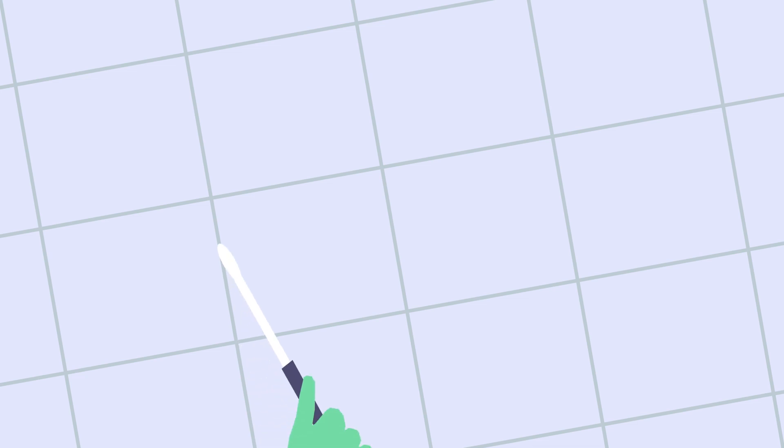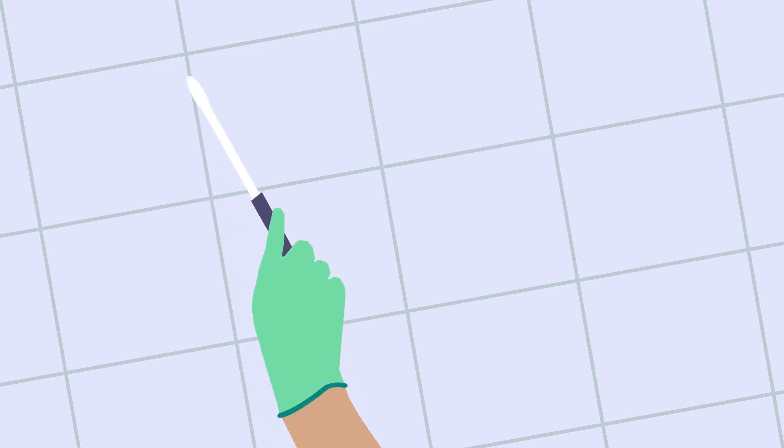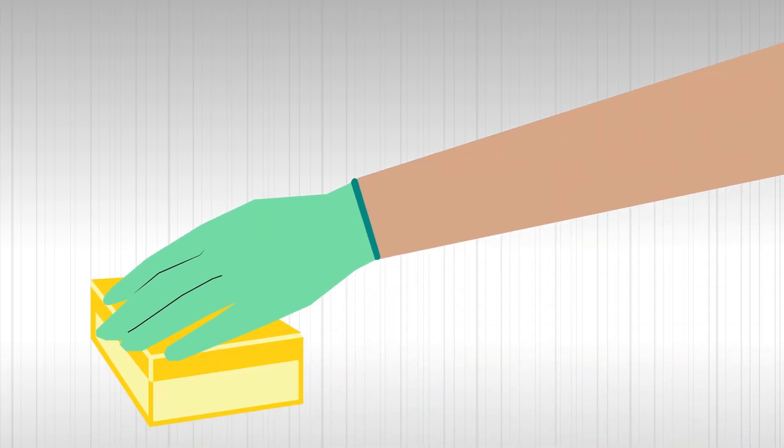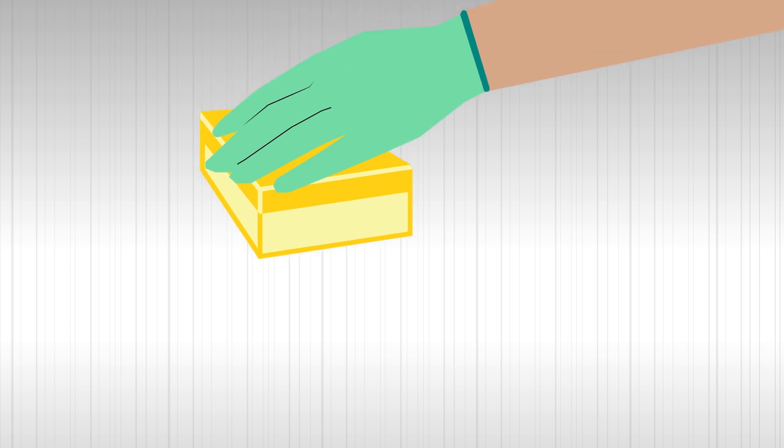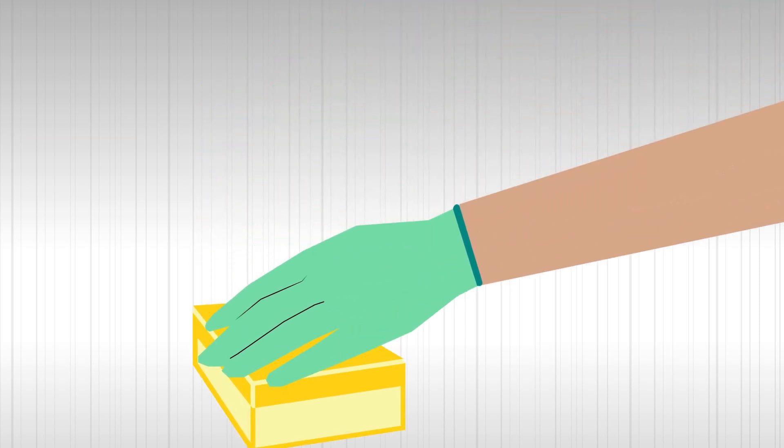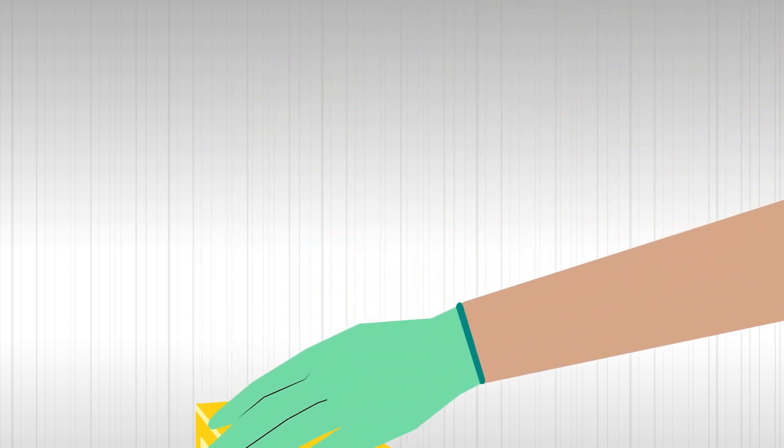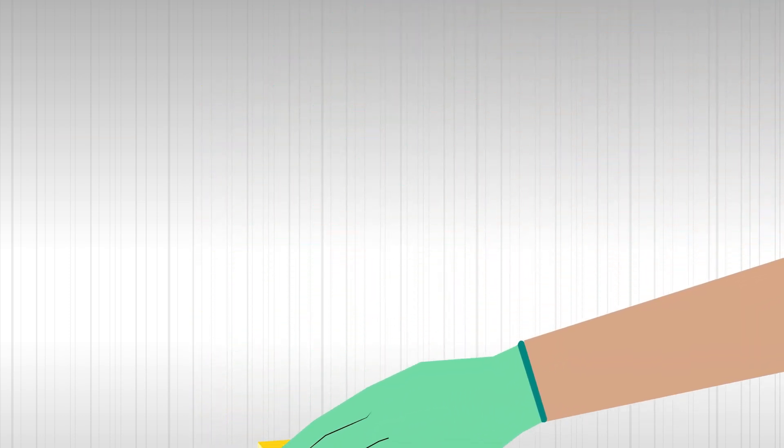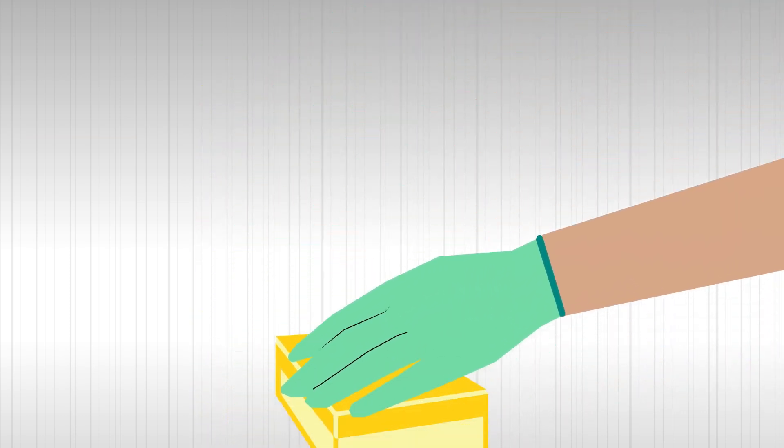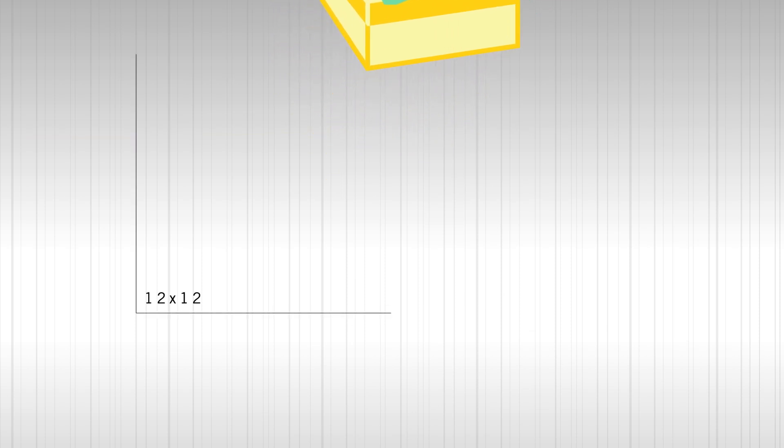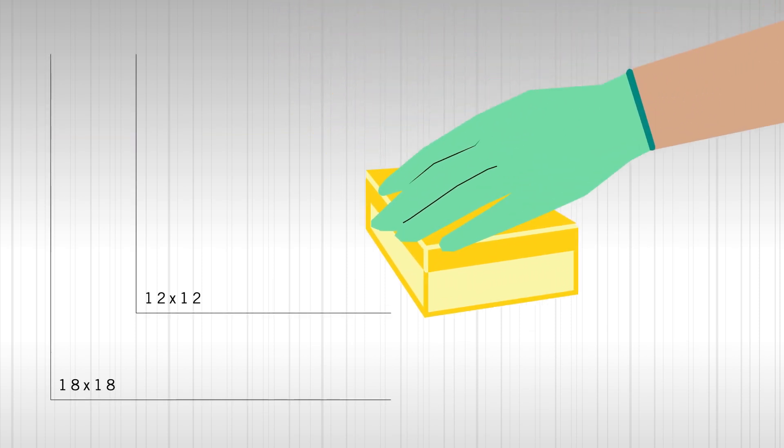A swab should be used when collecting samples from nooks and crannies, such as screw holes or behind silicone caulking, whereas a sponge should be used for all other sampling surfaces. Since the idea is to catch bacteria if it is lurking on a surface, the larger the sample surface, the better. Ideally taking a 12 inch by 12 inch or 18 inch by 18 inch sample size is recommended when the sample site has this much surface area.